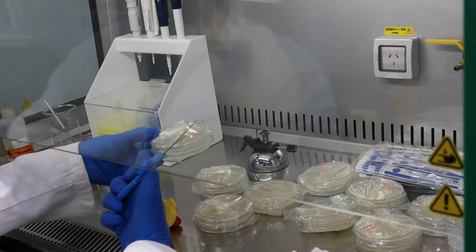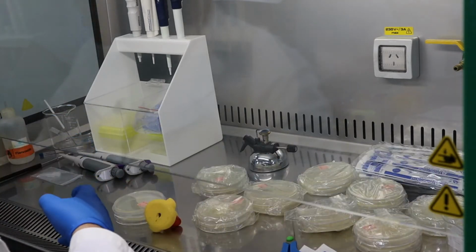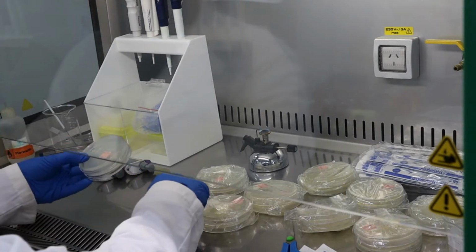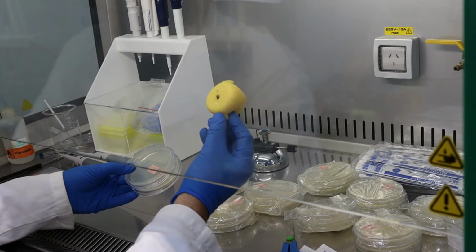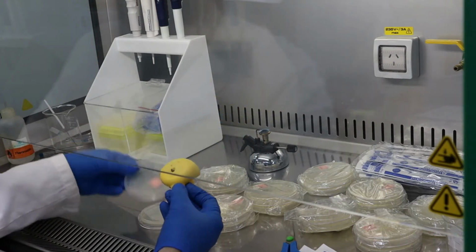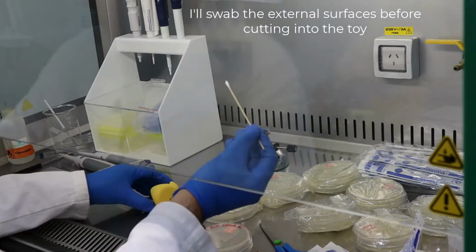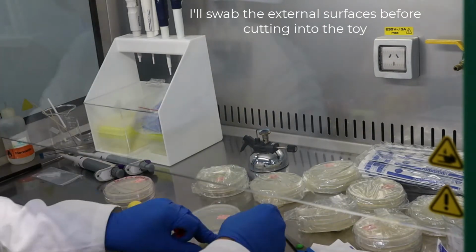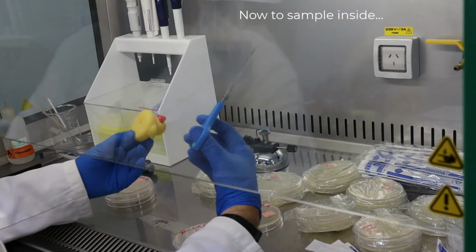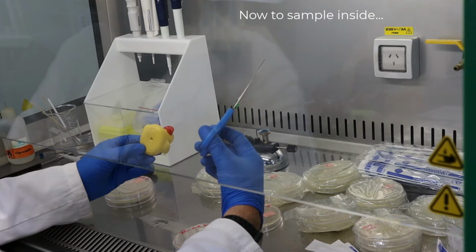I'm going to open these now. And what we're going to do is I'm going to swab sample from this particular yellow rubber ducky onto these Petri plates. Then we're going to incubate these and see what grows. I'm not sure how hard these are going to be to cut open, so we will find out in a minute.